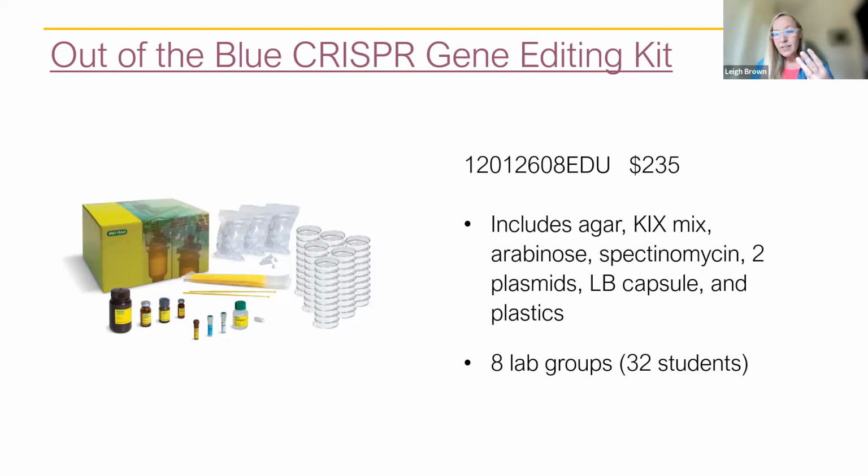You do pour three different kinds of plates: two different kinds of plates for the starter colonies, and one for plating the transformants at the end. It is a lab that takes one full day. It really takes a good solid 50 minutes. If you're on a 45-minute class period, there is a stopping point, and you can plate your bacteria the next day. They can just rest at room temperature about 40 minutes in and come back and plate them the next day. Then they look at their results the next day.